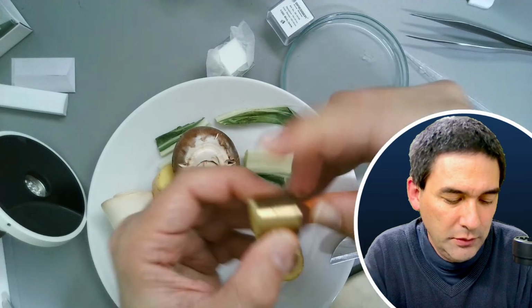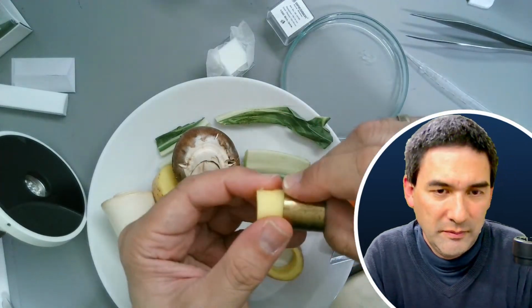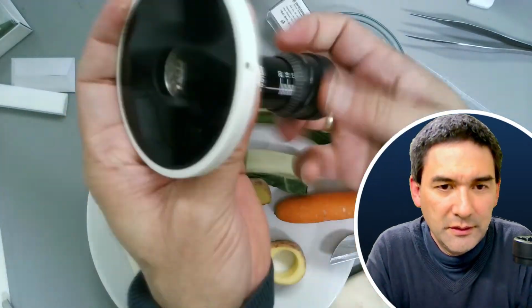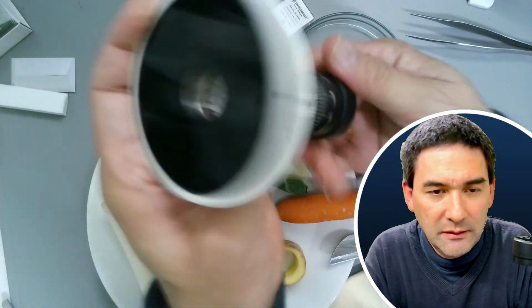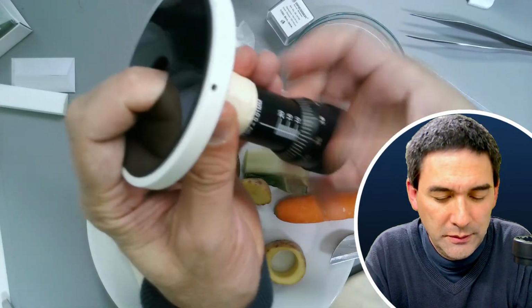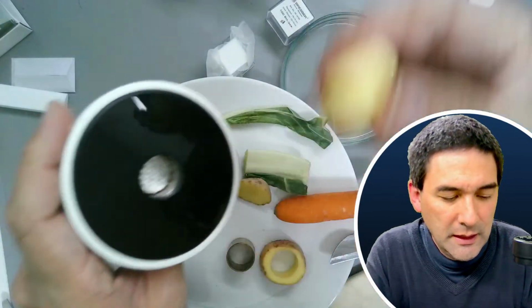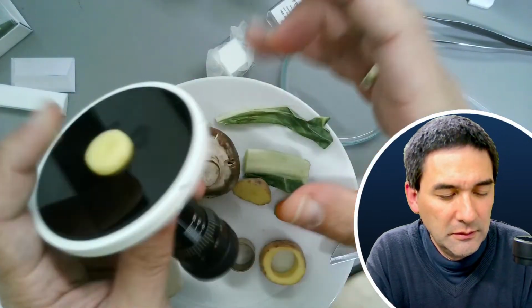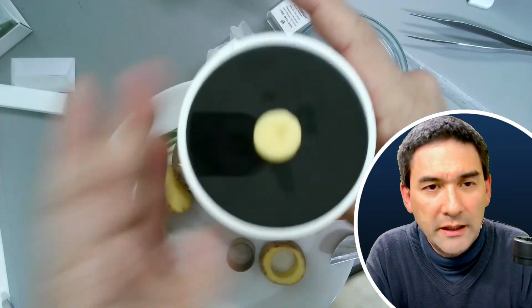Let's push it out, and let's turn this down, all the way down. Maybe not all the way, but a little bit more down. And now I'm able to insert this in here. And let's try it like that.